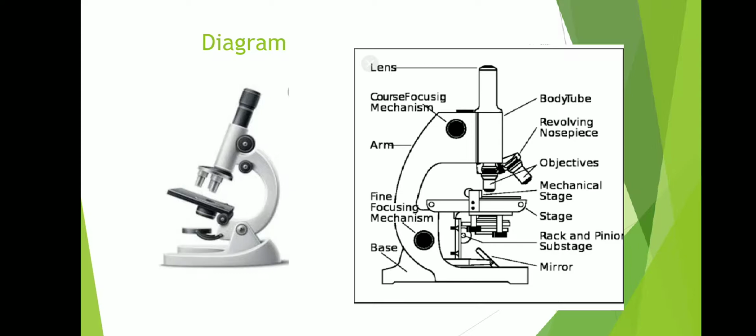and the condenser's function is to condense the light, and it passes the light upward in a pencil shaped form. This stage has a hole which passes the light transmitted from the mirror to the condenser and then to the stage. On the stage our slide is present.